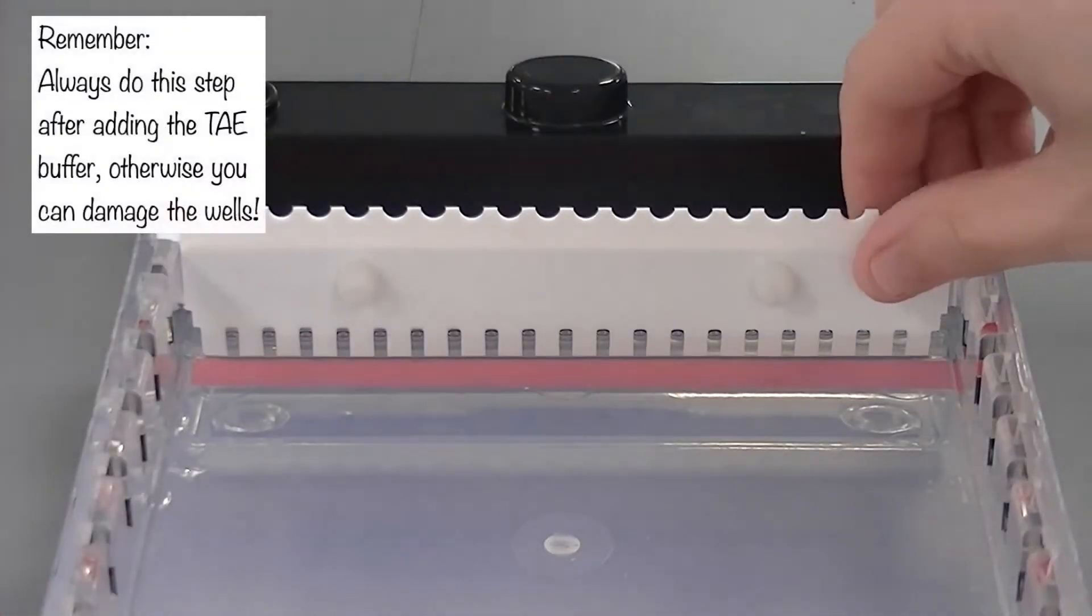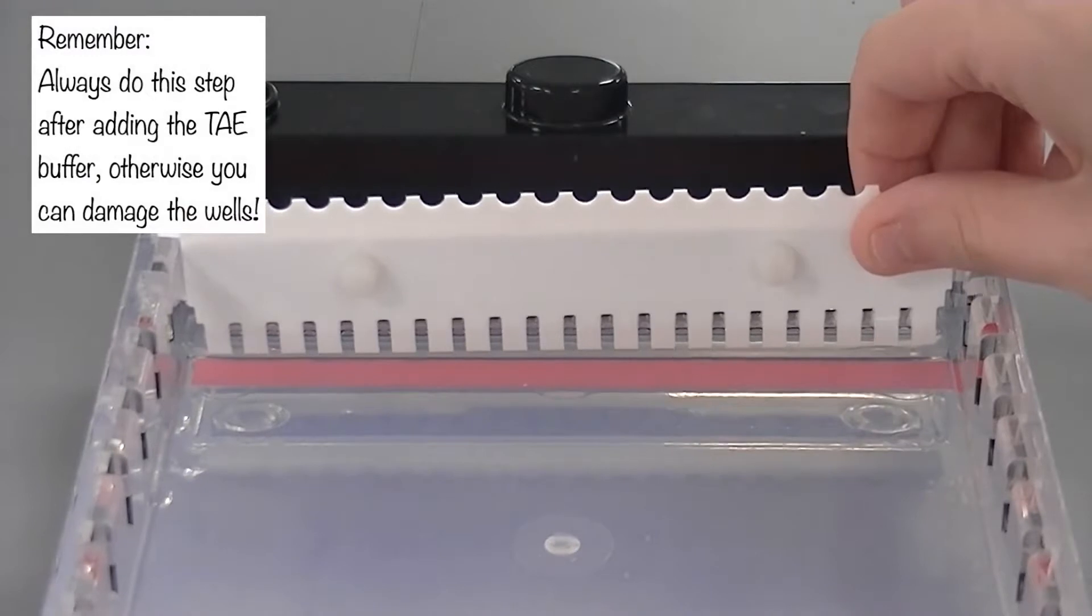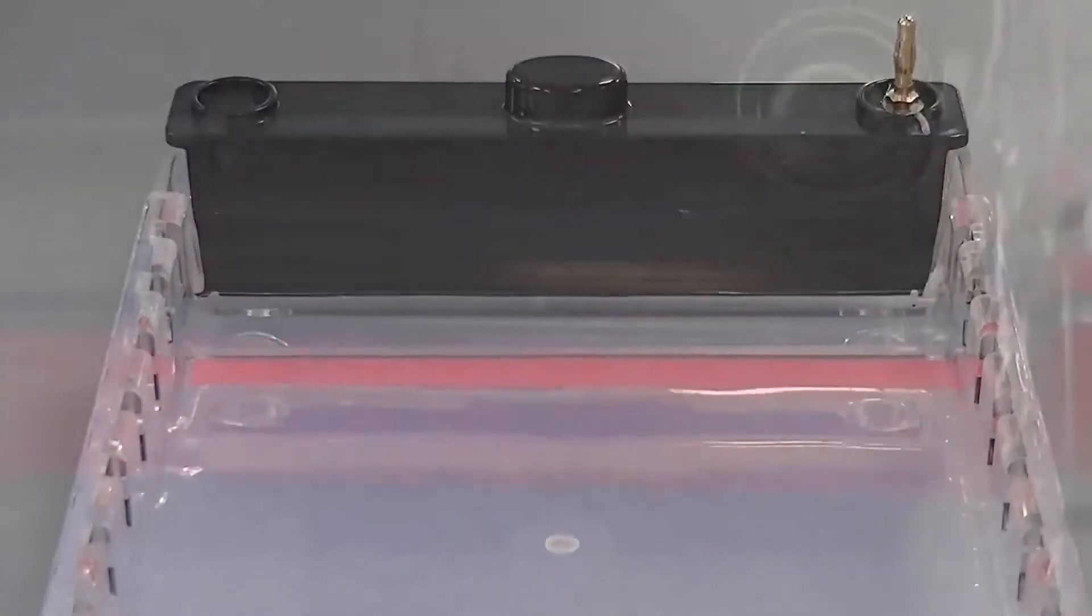Gently pull the comb from the gel, lifting straight up so as not to damage the wells. The size of the wells depends on the comb used. These are 25 µl wells.